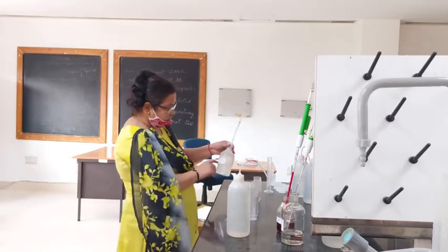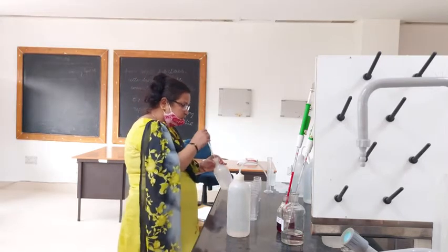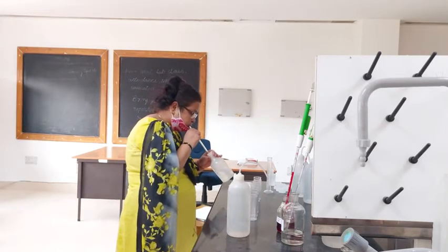It is standard fluoride solution, 1 ml equal to 10 microgram. That means it is 10 milligram per liter. 2 ml solution is to be mixed.